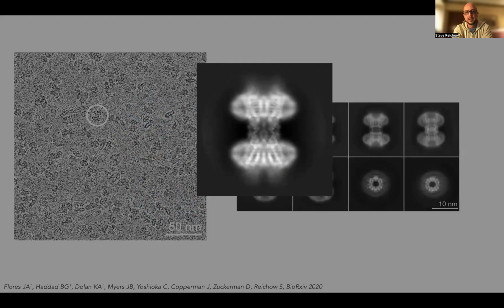And so I'll zoom in on this particular 2D class average to explain some of the features. So we could readily identify the two nanodiscs. So we had successfully put the channel into not one, but two nanodisc structures. And if you measure the separation distance between these two lipid domains, we measure 3.5 nanometers, consistent with what we would have expected.